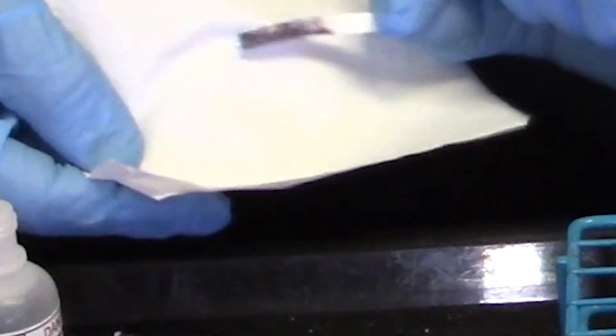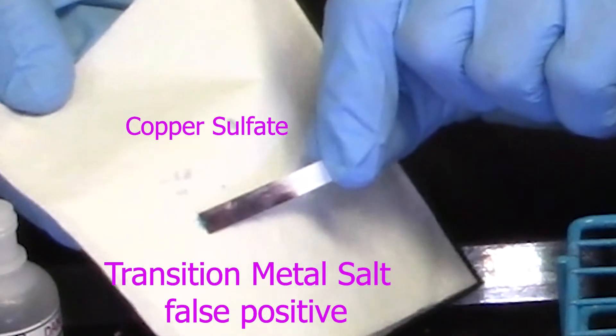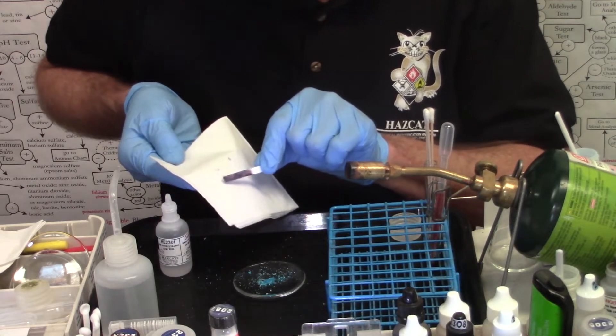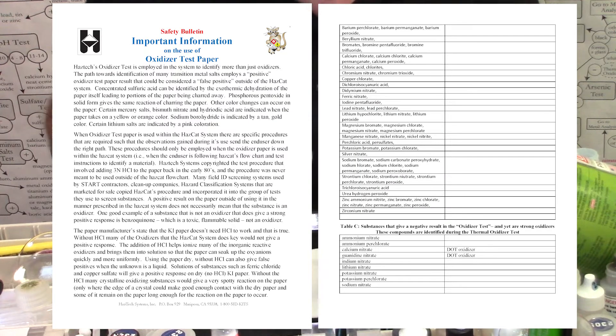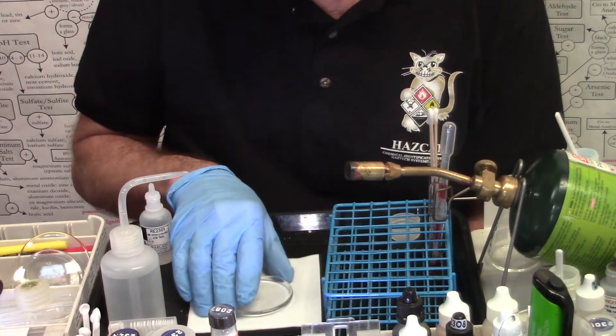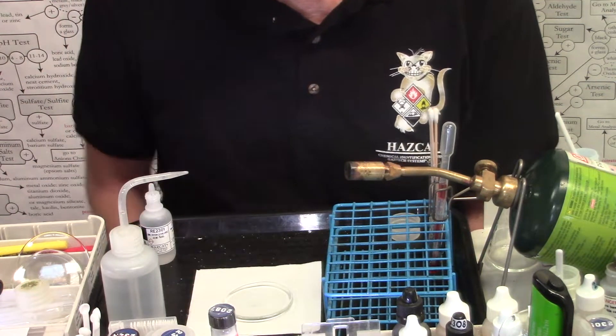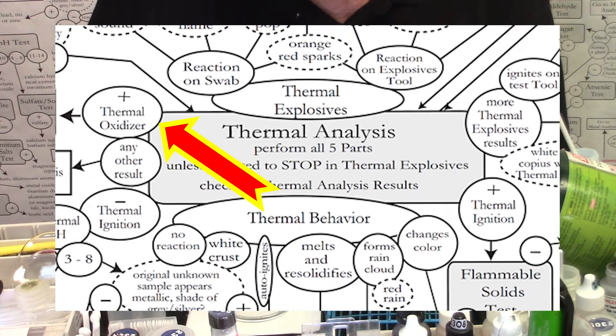And what do you see? Once again, looks like that would be considered a positive test. Okay. This one's actually a transition metal. This is a copper salt. This particular copper salt is not an oxidizer. So this is sort of a false positive. It's all taken account of when you actually use this test in the HAZCAT system. All right. We have a safety bulletin that we've published on the oxidizer test strip that talks about all the different reactions that can occur when you do this test. And also all the false positives and false negatives. Very, very powerful oxidizers like ammonium nitrate, potassium chlorate will oftentimes not be positive when you use the oxidizer test strip in this manner on the watch glass. They won't reveal their oxidizing nature until you put a little bit of energy into them in the form of heat. And so we use the same oxidizer test paper during the thermal oxidizer portion of the thermal analysis to identify those energetic thermal oxidizers.